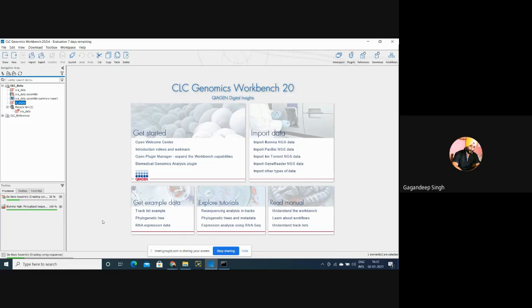I don't know how much data will be available for your particular targeted organism. I think data will be more than 1 GB. But if you select some microorganism, it will be around 10 GB. For some plants, it may be more than 100 GB or 200 GB. It depends on the organism which you are targeting. Okay. Now assembly is going on.